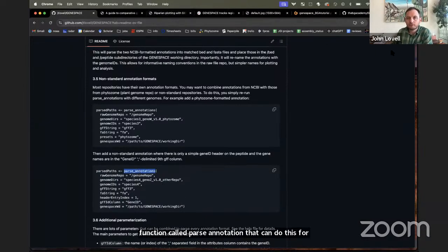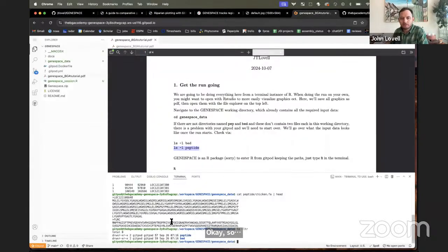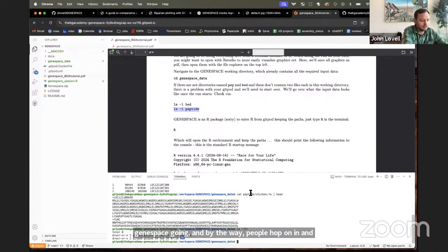Okay, let's go back to our session. The first thing that we do to get GENESPACE going, and by the way, people hop on in and let me know if there's an issue while you're getting this going.